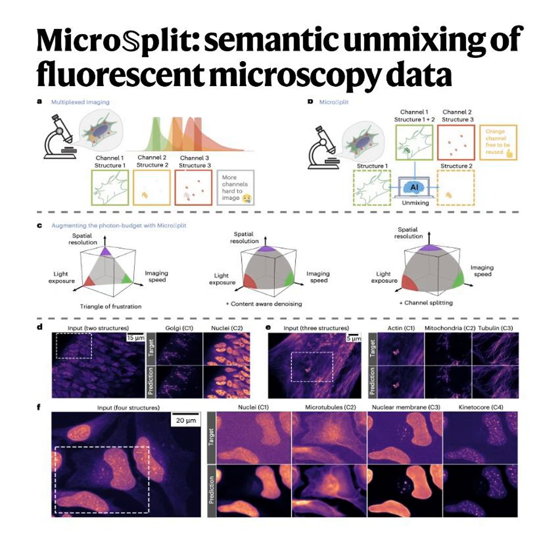And here's the critical part. It doesn't just separate them. It heavily denoises them in the process. Oh, wow. Which means we essentially just hacked the photon budget. By ditching those restrictive sequential filters, we're not just saving time, we're reclaiming our entire budget. Precisely. You're no longer discarding precious photons just to avoid spectral bleed-through. You suddenly have this massive surplus.